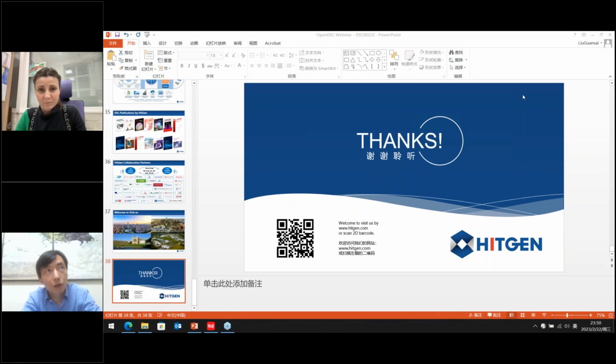So first, we will add, for the RNA target selection, for example, RNA patches to the selection system to block the unspecific binding between RNA and the DNA species. So this is the optimization during the RNA target selection.